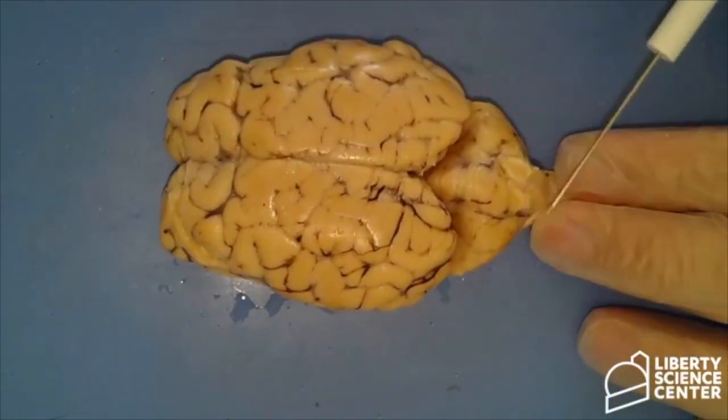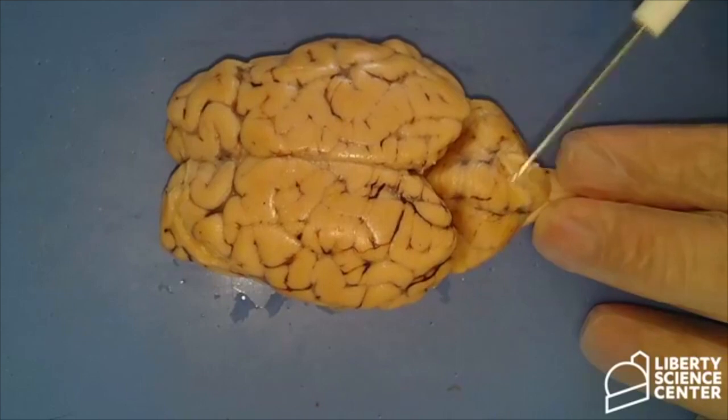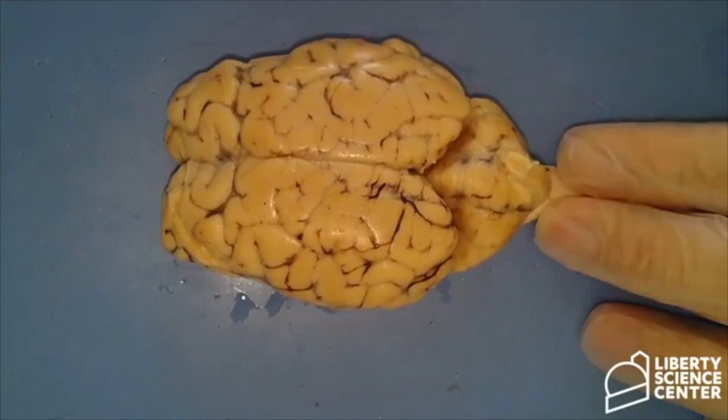This part right here is the cerebellum. It means little brain.